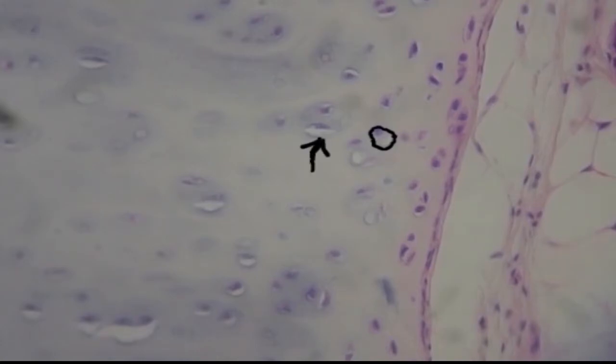And in this slide, you can even see these cells inside these lacunas. So you can see the stained nucleus of these cells. And so we have a name for these cells. We call them chondrocytes. And if you remember, chondro means cartilage in Latin. So we're talking about cells that make cartilage, chondrocyte.